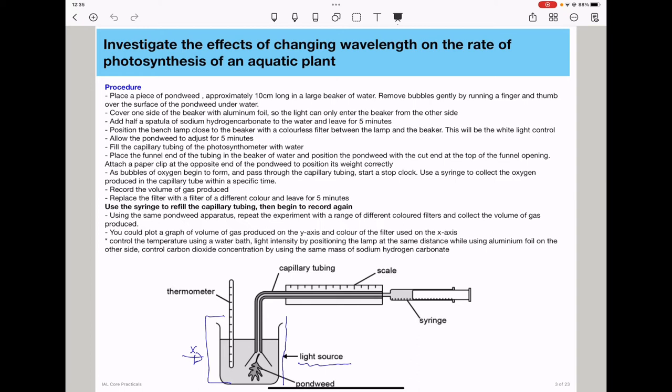In this experiment, some variables have to be controlled. You can control temperature using a water bath. Because here we are varying wavelength, temperature has to be constant, so you need to do preliminary experiments in order to know which temperature is going to give you the best results and perform all experiments at that specific temperature. And you will use a water bath to ensure that the temperature doesn't change. Light intensity can be controlled by positioning the lamp at the same distance while using aluminum foil on the other side.